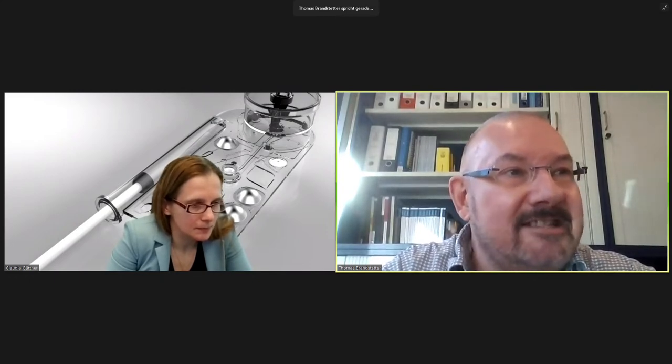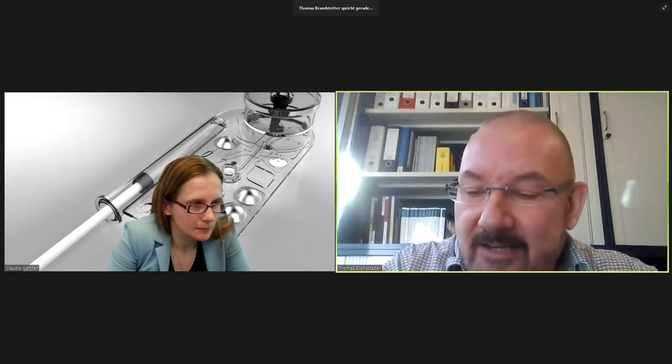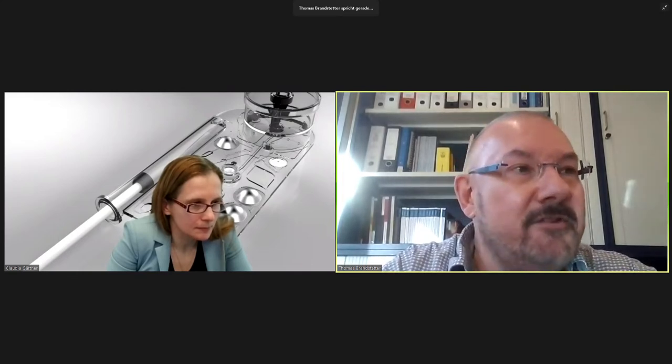What we are doing, we are working on different copolymers, which are relevant for bioanalytics, which are in agreement with the biology. We are microstructuring, also micro-nanostructuring of surfaces. We are changing, of course, the properties of the surfaces. We want to combine the bioanalytics within these surfaces. This is my part, of course.